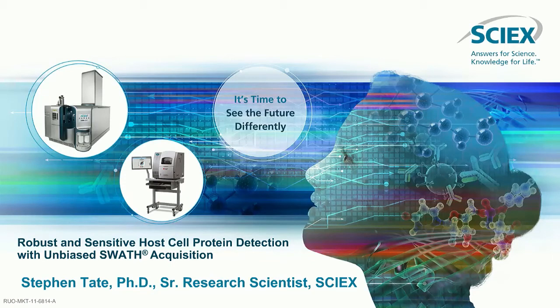Thank you for this opportunity. I'd like to thank Biopharma Asia for the opportunity to present some of the work that we're doing in collaboration with the BTI group in Singapore around how to develop robust and sensitive host cell protein methods using our SWATH acquisition method.